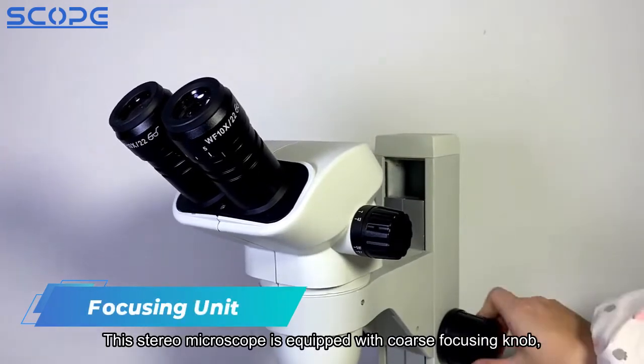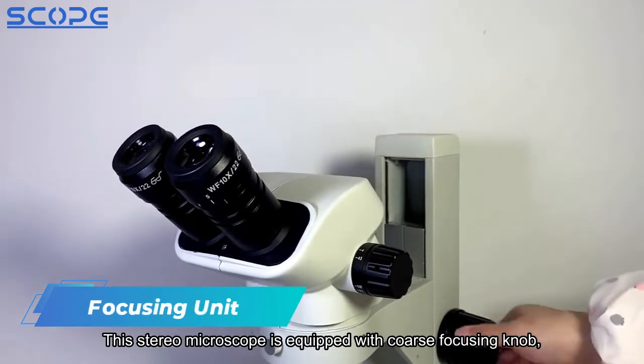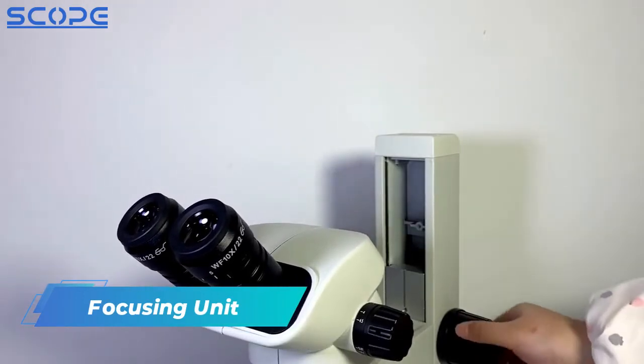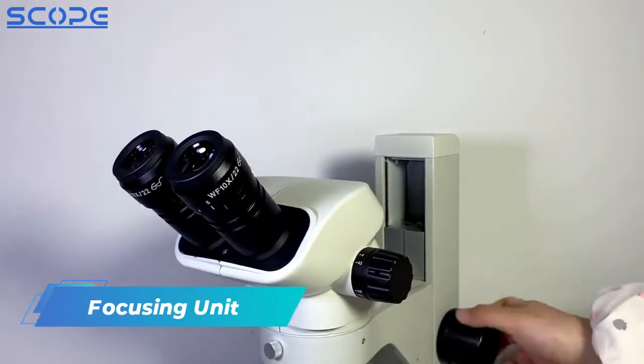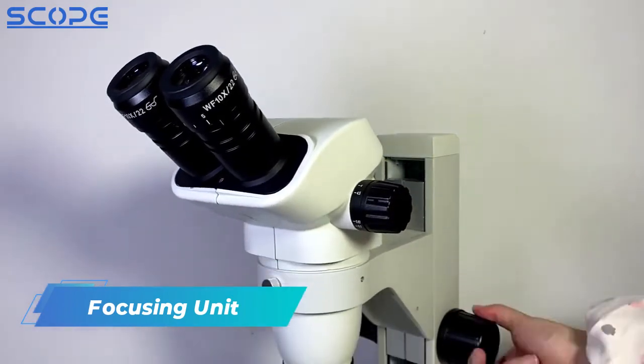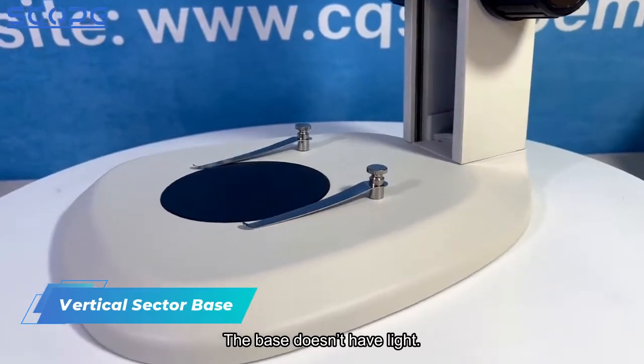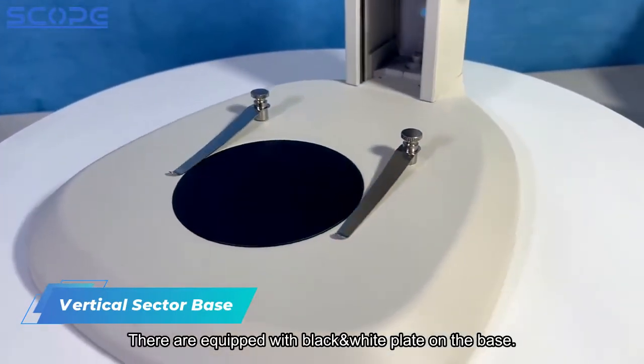This stereo microscope is equipped with a coarse focusing knob, and the stroke is 50mm. The base does not have a light; it is equipped with a black and white plate on the base.